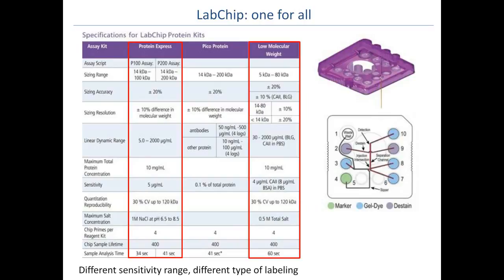So what is nice, this staining and this staining, it allows you to really quickly see the results. And what you can still see on the chips, going quickly here, is written the time of how much you probably need to run one sample. It's just a minute. So a 96-well plate is possible to check and analyze within 1 hour, and that's something, together with the staining, that you don't get in normal life with SDS-PAGE.